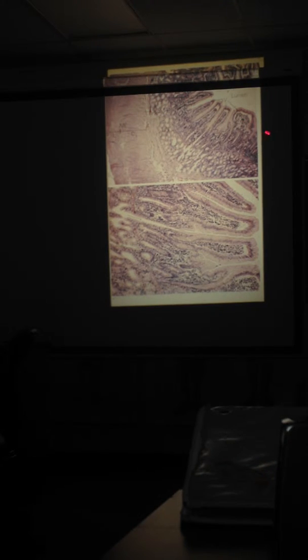Brunner's glands always tells you duodenum, the first part of the small intestine. So villi always tells you it's small intestine. Brunner's glands underneath tells you it's duodenum. More specific identification. And then you'll start to note the little bubbles, little openings along the villi and down in the crypts. They say those are a special cell or tissue.